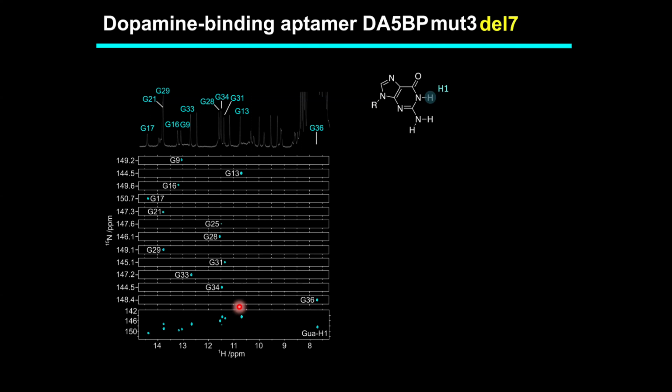And in order to not make any mistakes and to be unambiguous, and you can see why that's useful in the end, we took an assignment approach where we made many different oligonucleotides where only one of them was isotopically enriched for nitrogen-15 and carbon-13, which are the isotopes which are very useful for NMR. Which means we didn't have to guess at the assignment. We actually just made lots of different oligonucleotides. There'd be a single signal from each one.